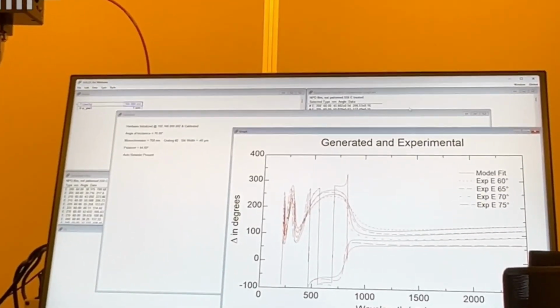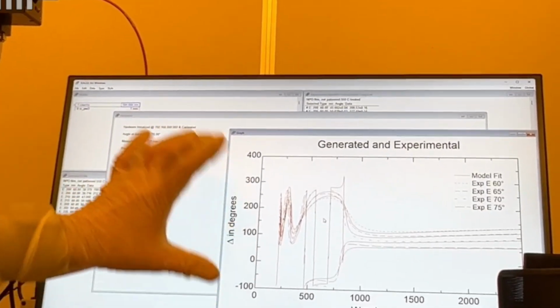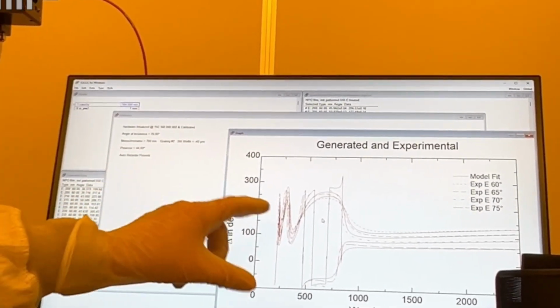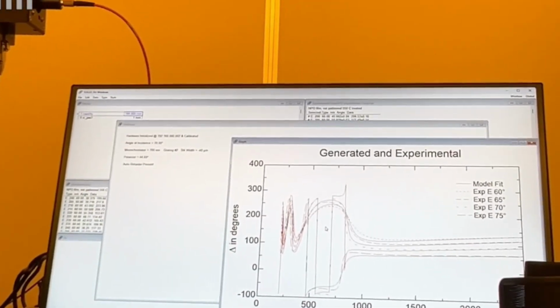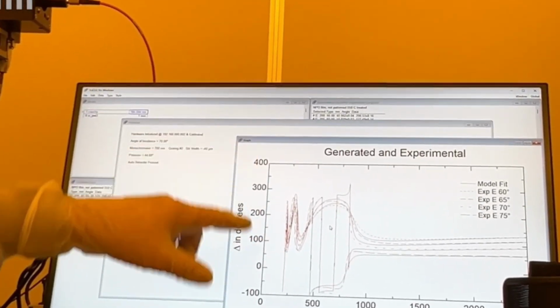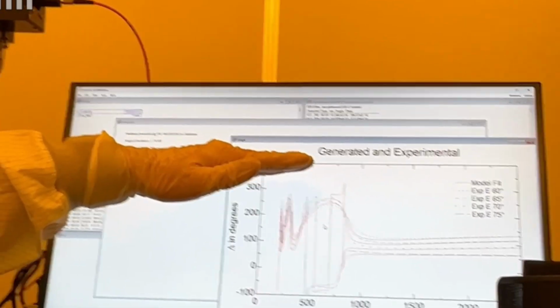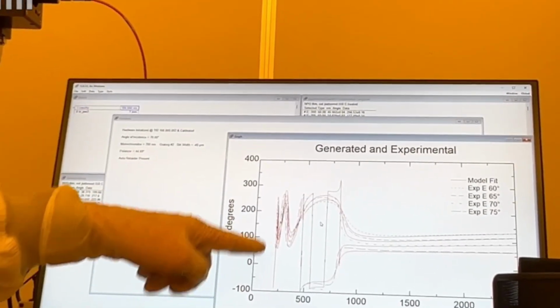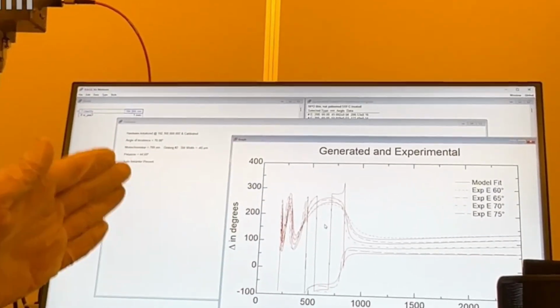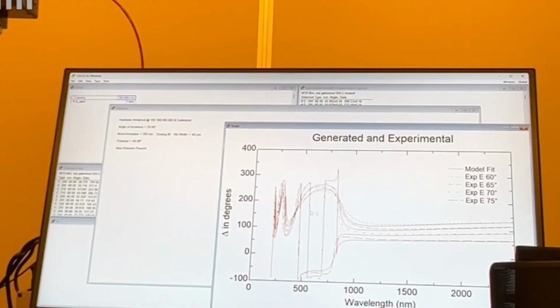So essentially, twofold. If you use the auto retarder, you can graph it over a 360 degree range. If you don't, you're going to see this over a 180 degree range. It's going to keep wrapping around. So what happens is we graph by default that delta range from -90 to +270, because things like glass have an oscillation around 0. Otherwise, you have these steps always at 0. So where it looks like sharp features, those are just simply wraparounds of the graph.